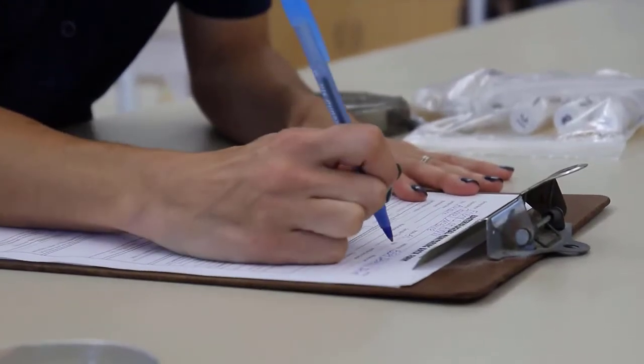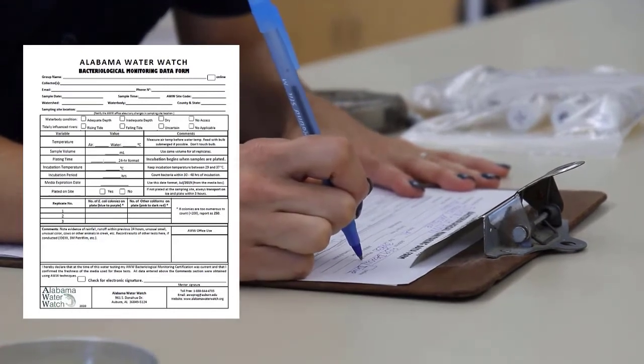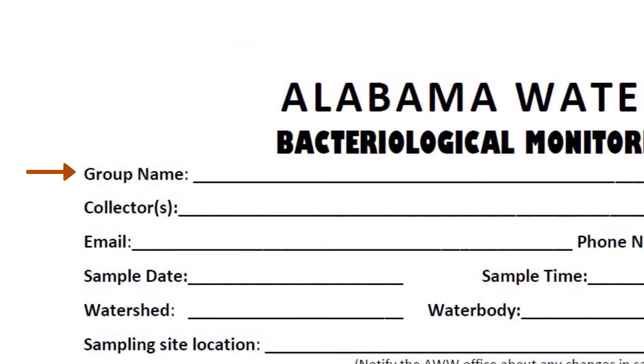You can fill out the following sections of your data form before you go to the field. Remember to write legibly. Group name. If it's your first time monitoring and you are not monitoring with an established Alabama Waterwatch group, you can leave this blank for now and contact the Alabama Waterwatch office to discuss an appropriate group name.